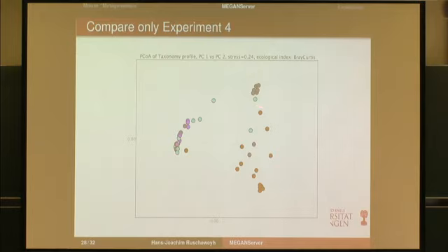This is a couple of weeks later where you start seeing the result, the beginning of the infection, and this is later where this group actually got sick, this one stayed healthy, and this one, the experiment didn't work. You can see that one.